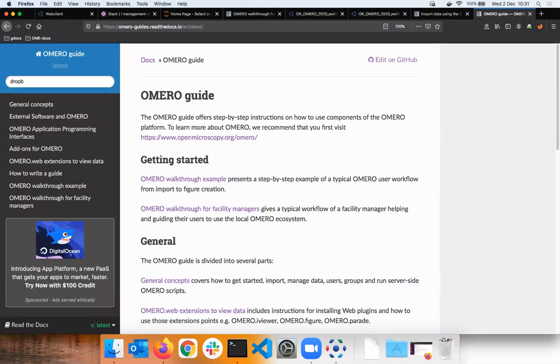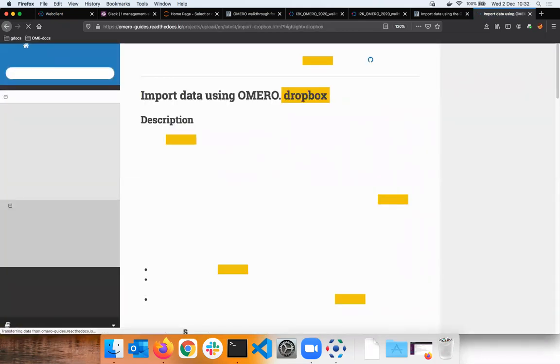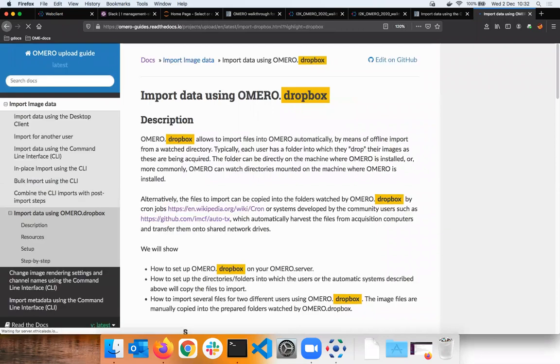Right. And it's an import. It's not something that creates the link. No, in that case, that's a full import. That's the difference. But you can have both. You can set it up in such a way that you can in-place import from Dropbox.